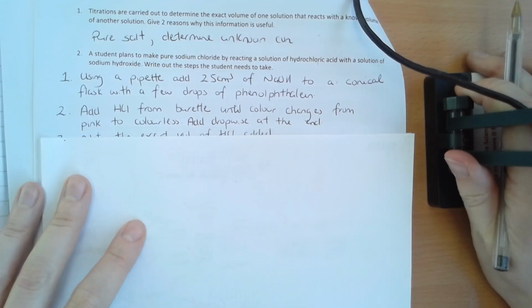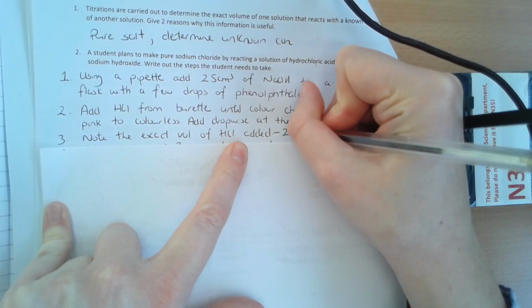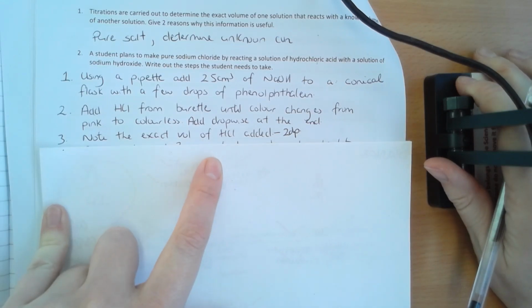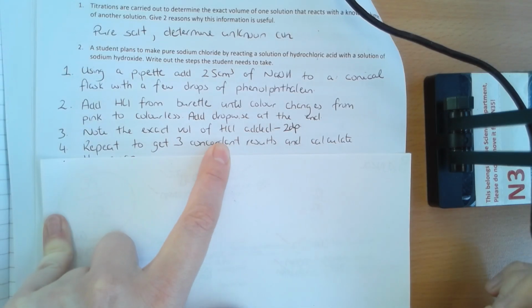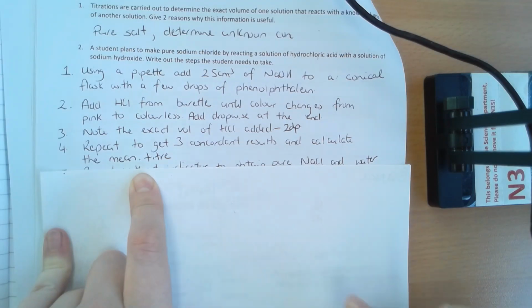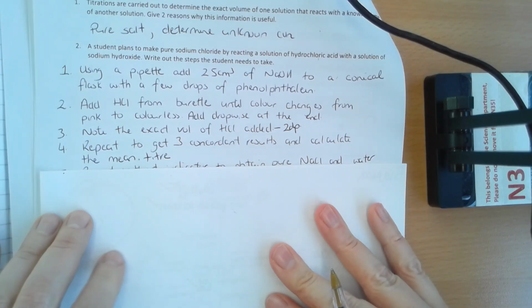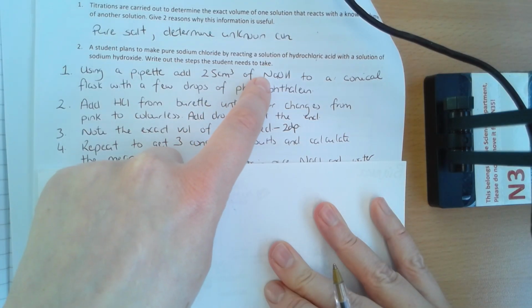On the mark scheme it wants some fine detail, specifying the indicator, saying add dropwise, that's you giving fine detail. Once you've got that colour change, you want to note the exact volume of HCl added, and you're going to note that volume to 2 decimal places. That's not enough, however. You need to repeat it multiple times because you need to get concordant results. They're results that are within 0.1. At GCSE, I think they allow you to say 0.5, but at A level we say 0.1. Once you've got your 3 concordant results, you're then going to calculate the mean titer. The volume added from the burette is called the titer, and you're going to get a mean titer. So at this point, you know exactly how much acid is required to neutralize that NaOH.